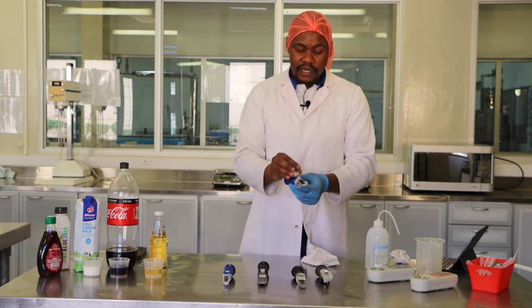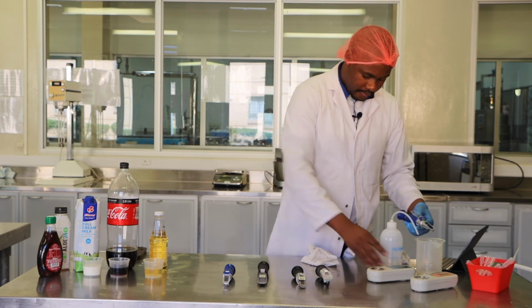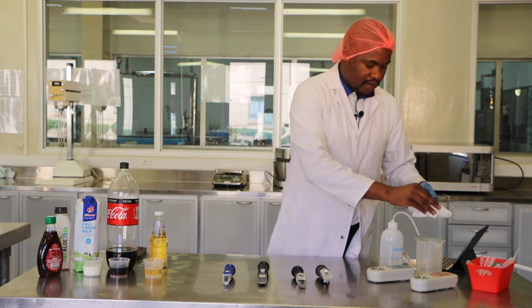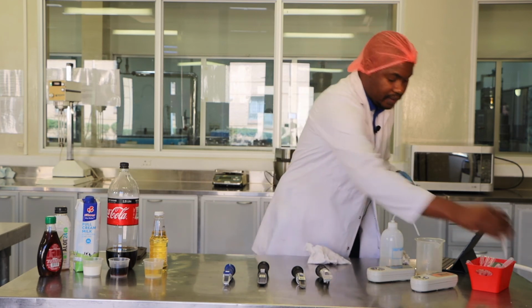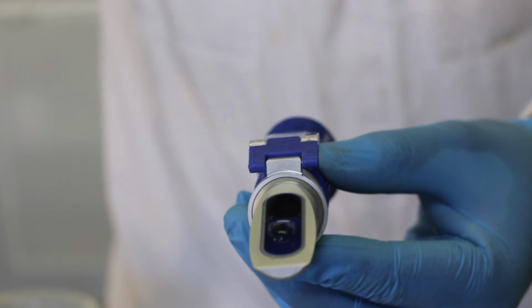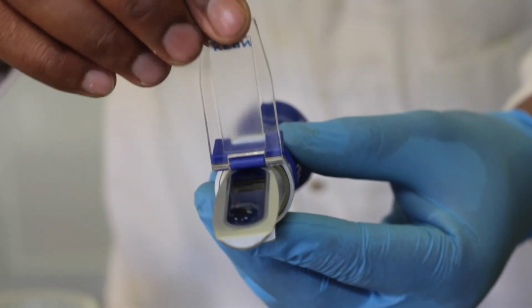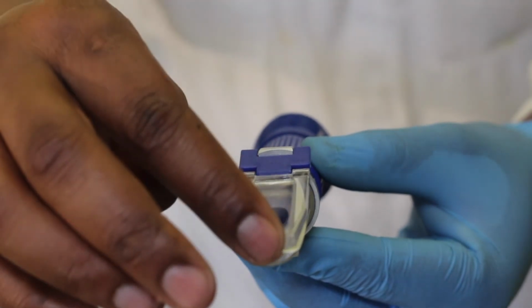So the first thing you do is clean your refractometer, blot it with paper towel, and then you just need a drop of sample, and here you can close.